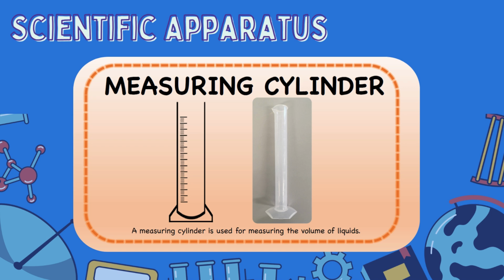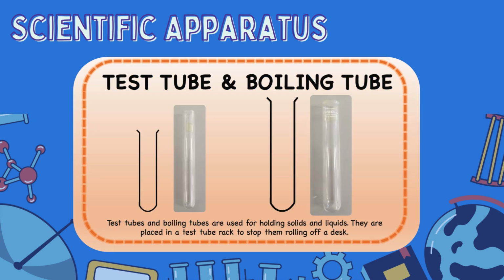Here is a measuring cylinder. This would be much better for measuring the volume of liquids. You can see the small graduations down the side of the tube. Here we have both test tube and boiling tubes. These are used for holding both solids and liquids, and to stop them rolling off of a desk, we put them in something known as a test tube rack.